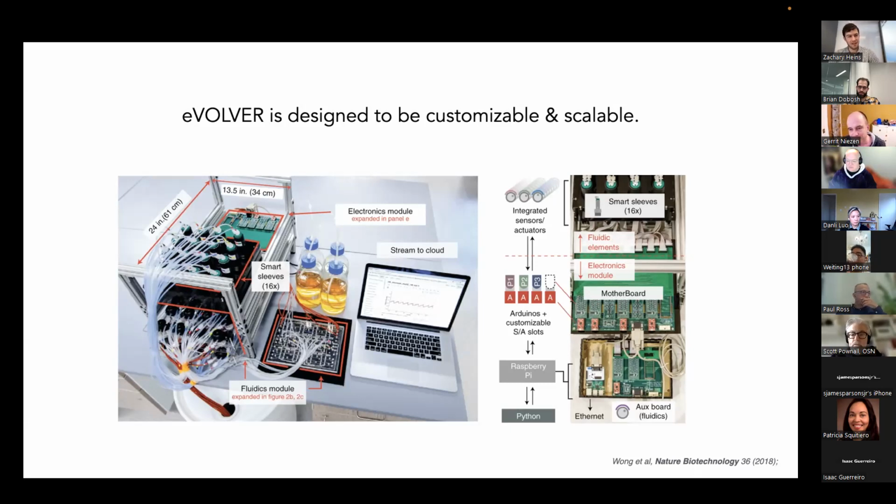Yeah, actually, I think it's awesome that there's all these other platforms that are popping up now. I think they're borrowing and also making some things better. There are some things I think eVOLVER does better than others, like the scalability and the way you can interact with large numbers of vessels at once. I've used the Kai-Bio system recently, and it's still great. I think a lot of the hardware on it is actually higher quality than eVOLVER, so you can get fluorescence out of the box, and you get different types of temperature, and it's a very nice system for what it is, but I find the scaling of it was actually harder.